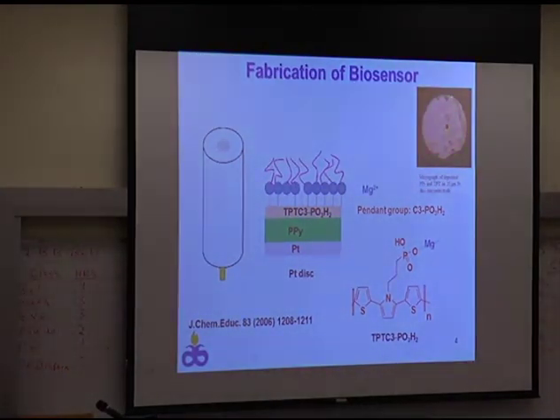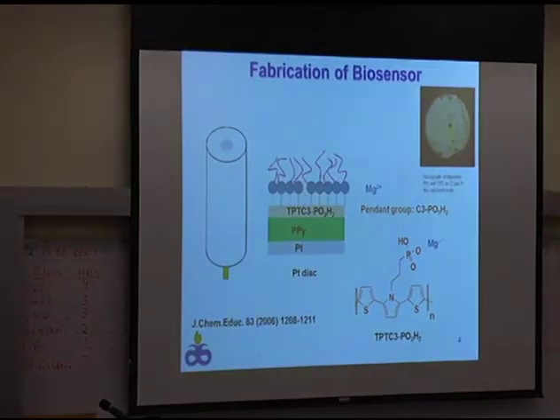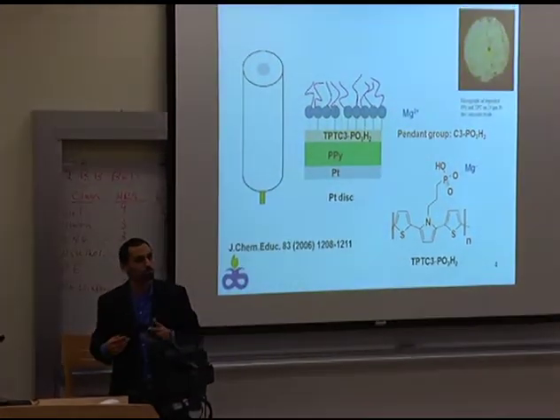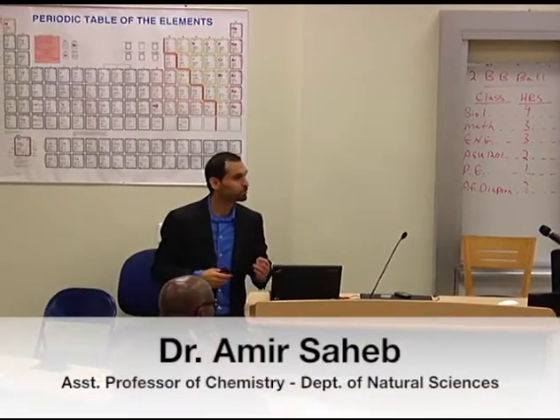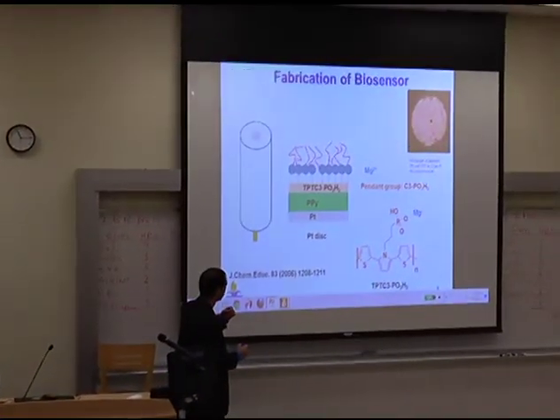So now to see that, you really need a microscope. And that's the platinum disc with the layer, with the sensing layer deposited on it. If we didn't have that layer deposited, it'd be a nice shiny platinum metallic disc. So we deposit the sensing layer. It consists of a bilayer of conducting polymers. So conducting polymer, it's a polymer, kind of like plastic, which conducts electricity. And we need it to conduct electricity so we can use it as an electrochemical sensor. If it didn't conduct electricity, it would just be an insulator. We wouldn't be able to read any information, any potential difference.